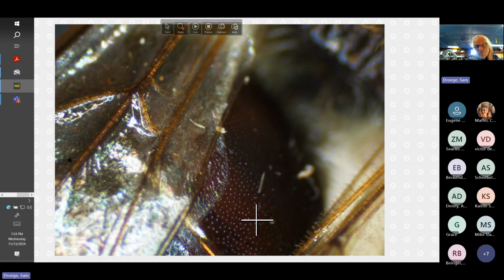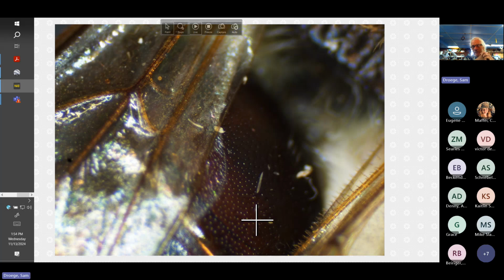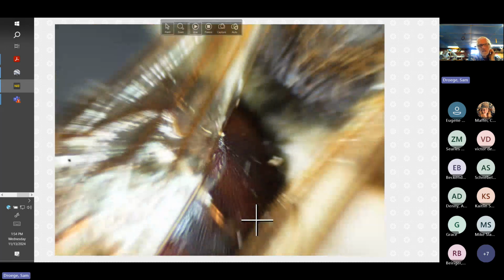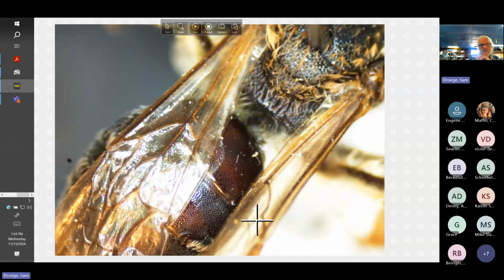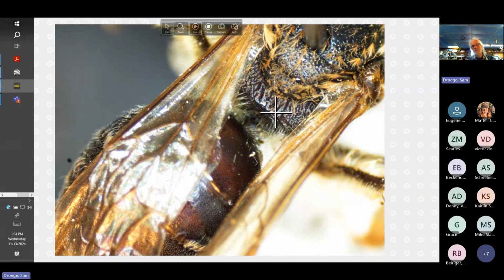And if we use these small pit diameters, you can see that, yep, at least three, often greater than three pit diameters apart from their nearest neighbor. So that gives you a pretty distinctive hit on the species. You can see our friend, the rectangle, and these rectangular cellular-like structures here on the propodial triangle.